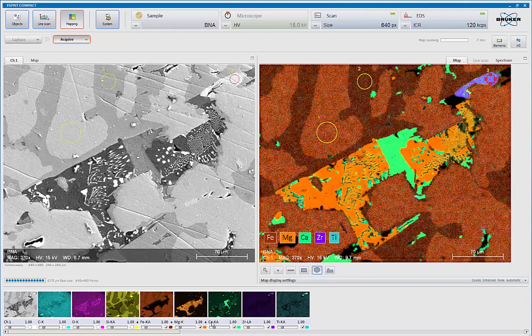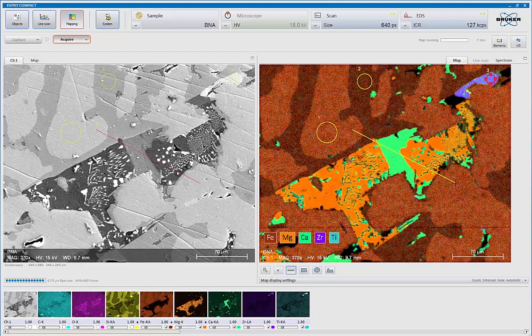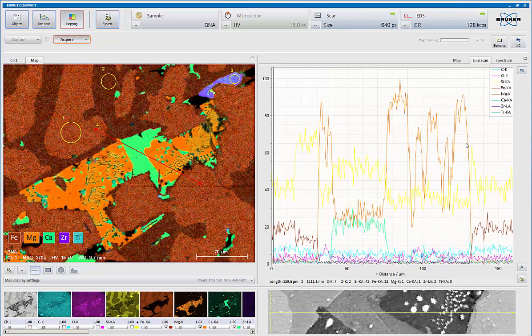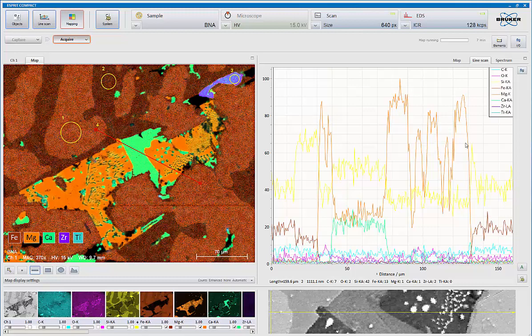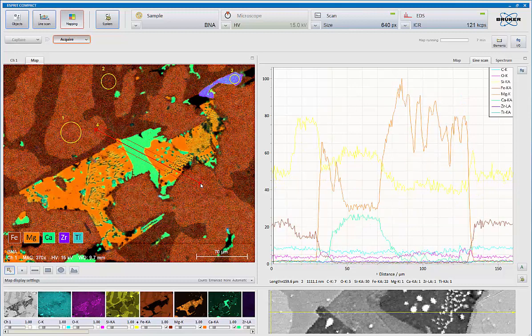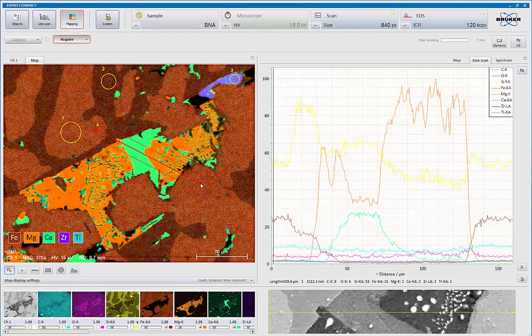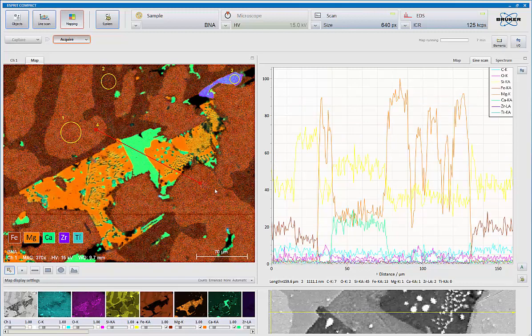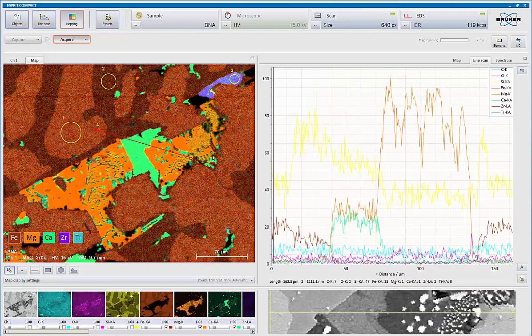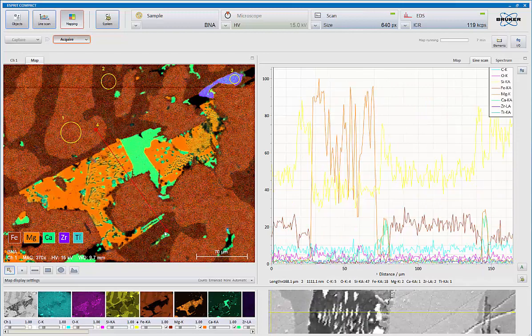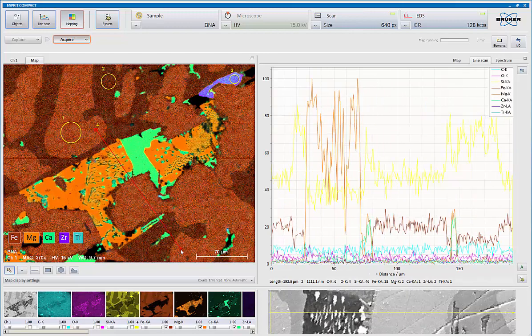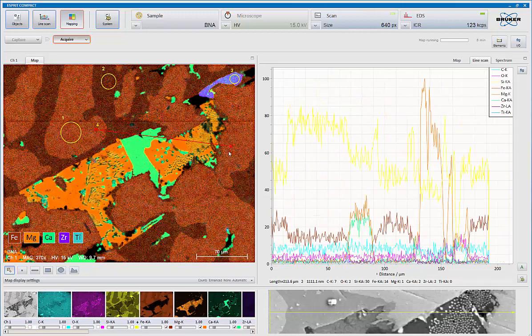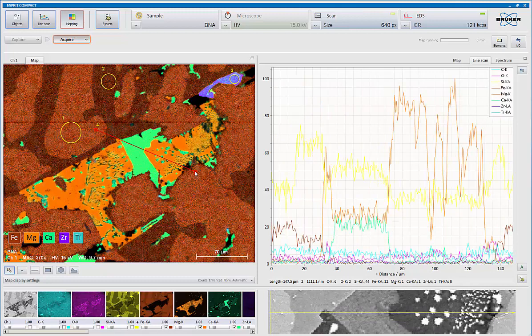I can also extract spectrum at any location. And one of my other annotations, line, I can put a vector in any orientation. And now I can look at a line scan. So relative to my map, this is the digital line scan across there. And since we're live, that data is being updated. So as we pass through, we'll see more data coming in. If I wish, I can adjust this line, simply by clicking on it, and using the plus-minus keys, I can integrate so many vectors above and below that region. So you have the zoomed-up area here showing you where that profile is. You can also pick that up while you're collecting and look at different vector distributions along any area.